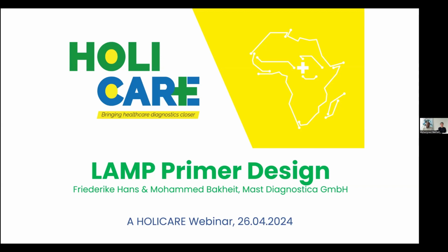For that, we had already the previous seminar done by Dr. Hamid Ismail, which is a very big help in this part. And there will be a third part, which is a demonstration on how to perform primer design using this online tool called PrimerExplorer. I'll be talking a little bit about it then in the third part.